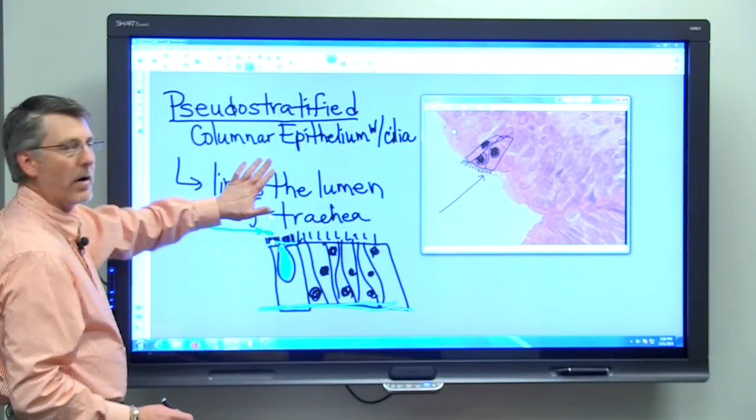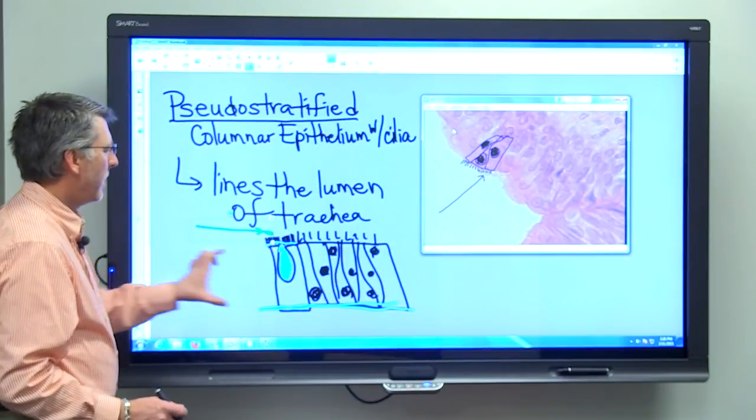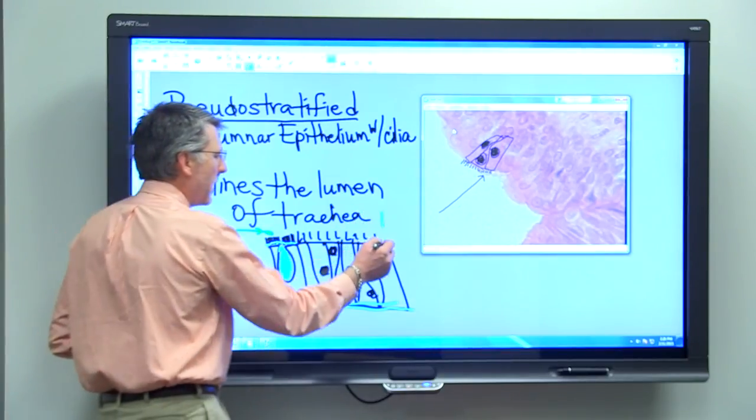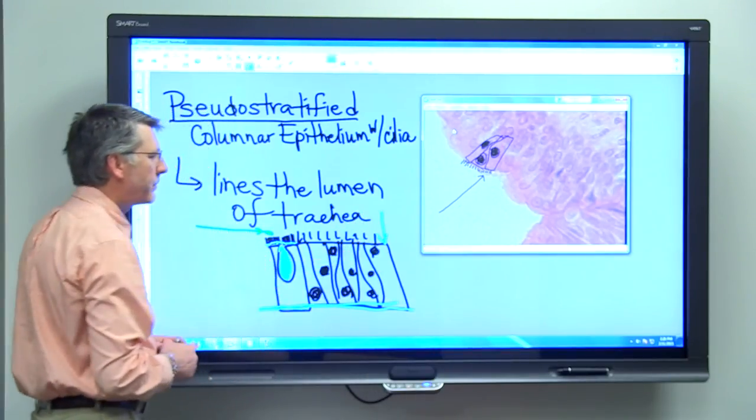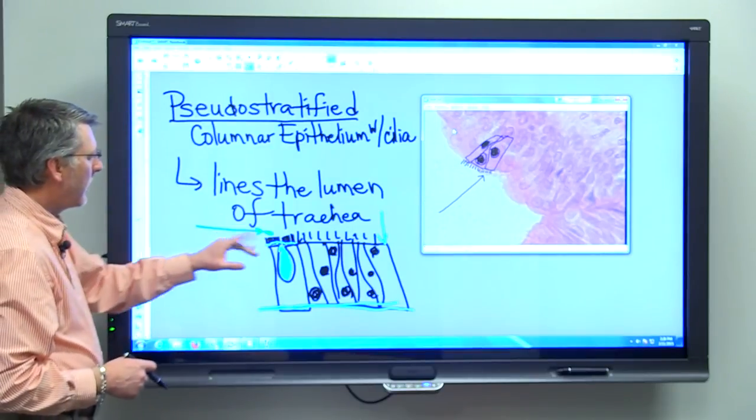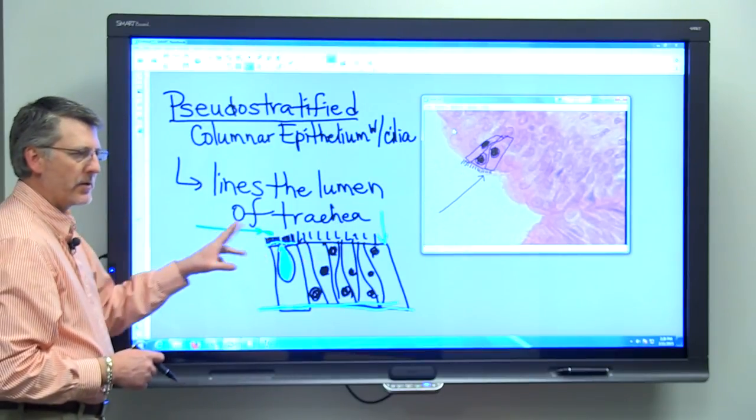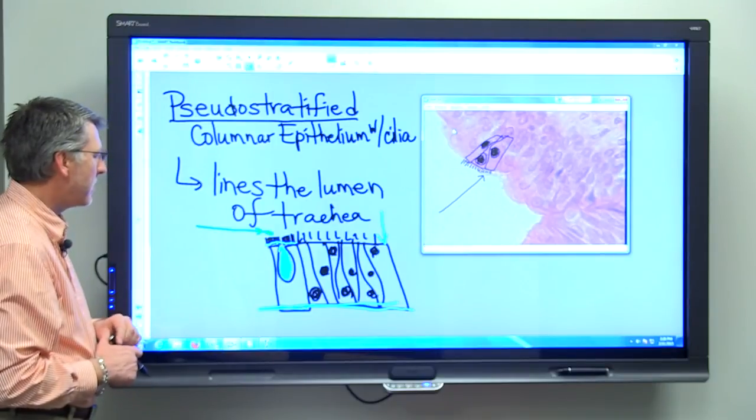Pseudo-stratified columnar epithelium with cilia. Thick cells help to protect the lining of the trachea. They have cilia, which help to distribute mucus that is secreted by this tissue.